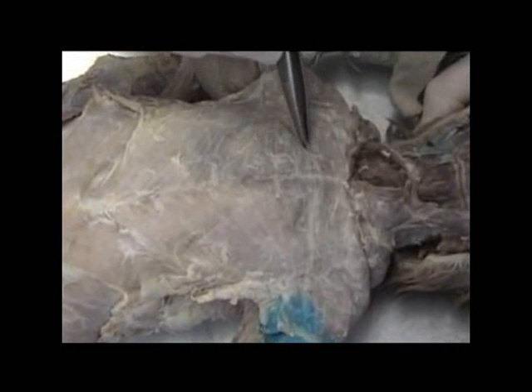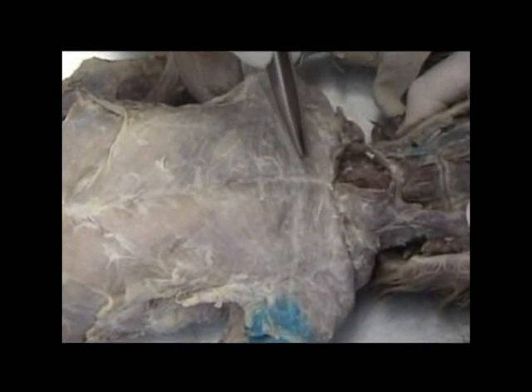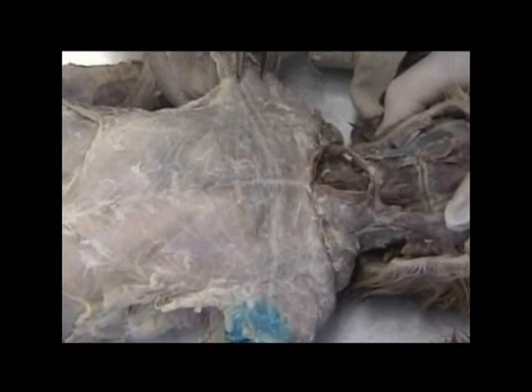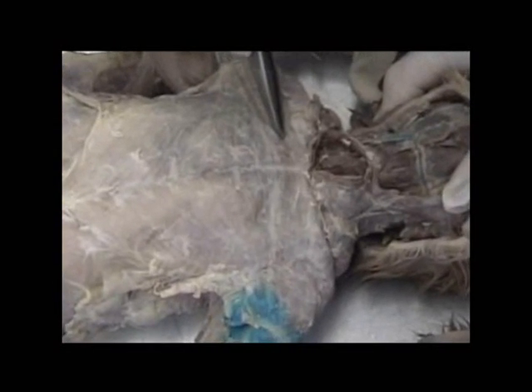Right above that, coming at a little bit more stark angle, is this muscle running up through here, here, and here. Again, running this direction across. This is the pectoralis minor. Up in front of that, more superior, or more anterior, is this muscle, which actually comes and runs all the way up underneath this. This is the pectoralis major, and lying over the top of the pectoralis major is this band of muscle running right across here, which is the pectoantebrachialis. So xiphihumeralis, pectoralis minor, pectoralis major, pectoantebrachialis.